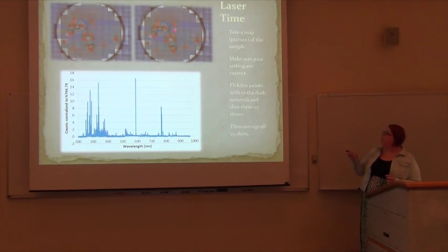And then our second photo here, all these dots, this is where I actually shot the laser. We have to record where we shoot the laser, reason being if we need to go back, we need to see where we shot the laser, and as I go on in my talk, you can see that if we go to different machines, we need to see where we actually shot.